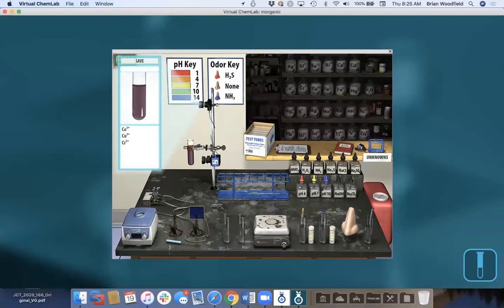So I can go to pH 4, and see, hey, there's my litmus paper, pH 4, here's pH 7, here's pH 10, and I show the chemistry of what's going on when you go to pH 10. So everything forms a precipitate, and I could centrifuge that if I want and force it all to the bottom, or I can go to sodium hydroxide and then show that the chromium is in solution, but I add sodium. So if I do a flame test now, I'm not going to be able to see the copper because it gets masked by the sodium flame. So I can centrifuge that, I can decant, and in decanting, I'm left with my two mixtures here.